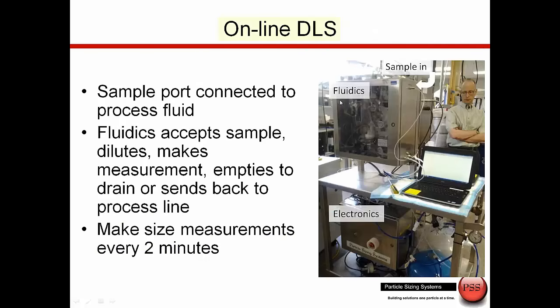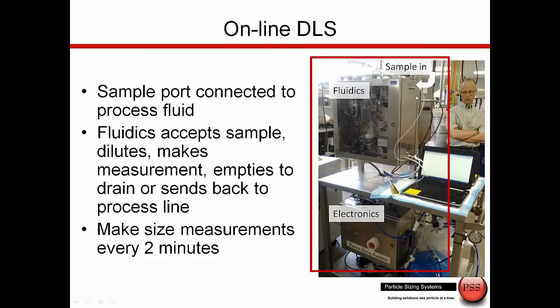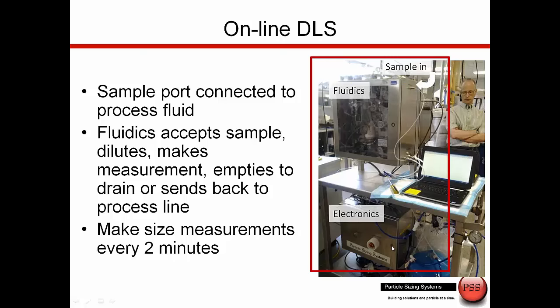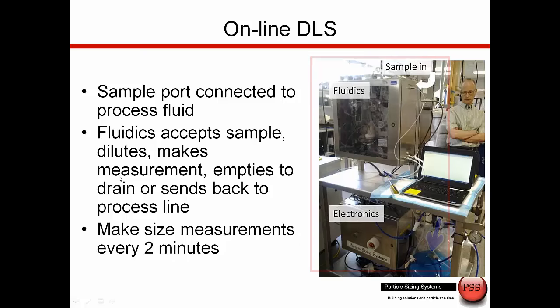This is the instrument inside the plant in Cambridge, Massachusetts — this is the online system. The sample comes in here through a quarter-inch tube from the process. Inside is the fluidics where we do the dilution. Down here we have the electronics which take care of running the instrument, and down here we have the diluent. So what we do is take in the sample, the fluidics dilutes it, we take the measurement, then we drain, clean up, and get ready for the next measurement.